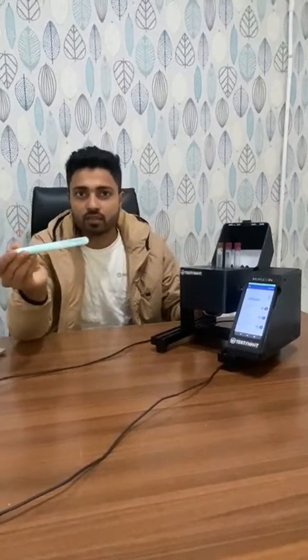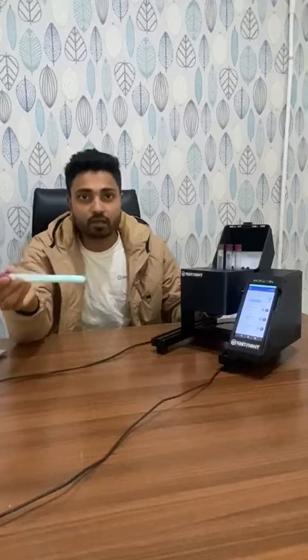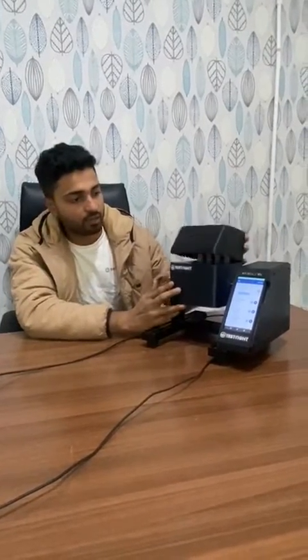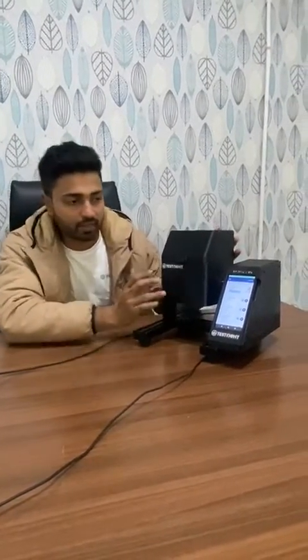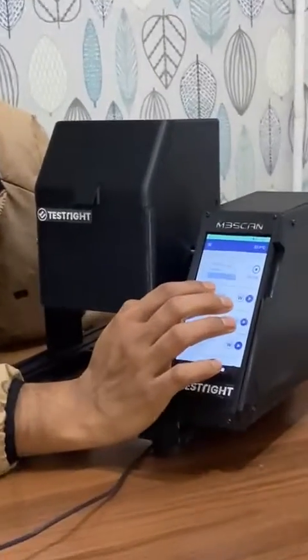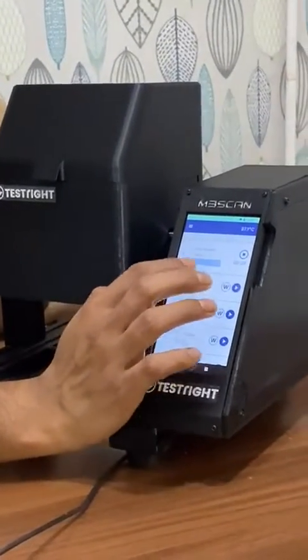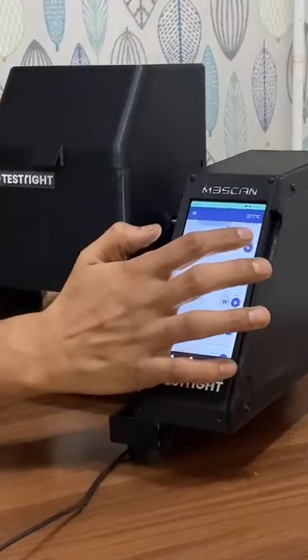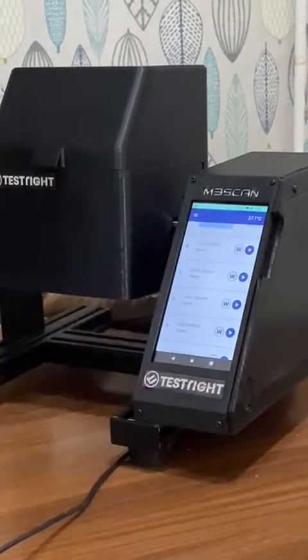To use MB Scan, we prepare the regular MB-RT tube with milk and a dye, and insert it in the respective channel in the MB-RT machine. We close the lid and go to the respective channel on the touchscreen display and click the play button in front of it.